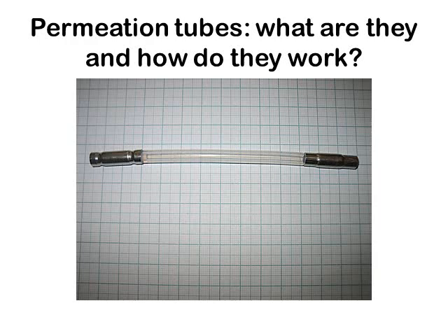Permeation tubes are a very popular means by which we can simply generate a standard rate of emission of a vapour under thermostatically controlled conditions. If such permeation tubes are placed in a well-controlled gas flow, then we can dynamically generate standard concentrations. These devices are made conventionally from PTFE tubing, filled with the VOC or SVOC of interest, and sealed at each end with solid PTFE plugs, as shown in the photograph.